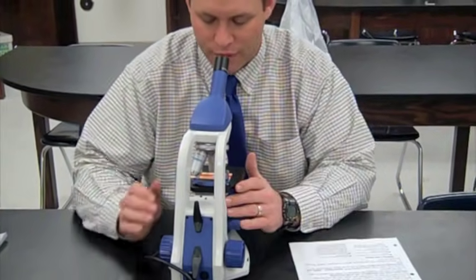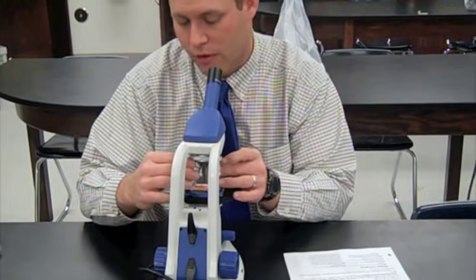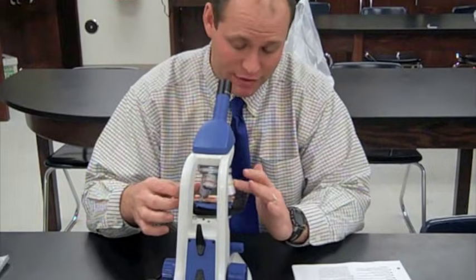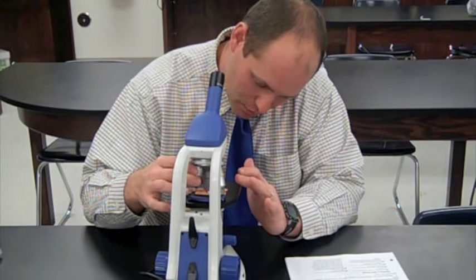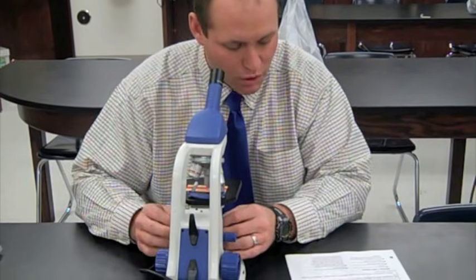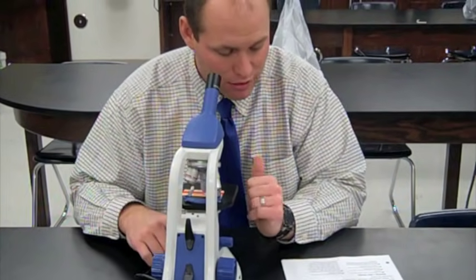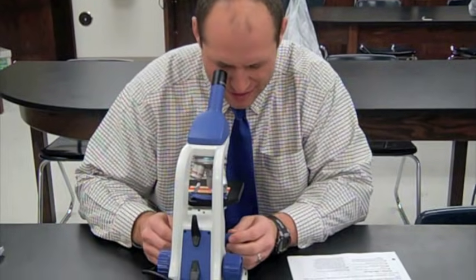Okay, now we're going from the 10x power to the 40x power, and it's probably one of the harder things to do because you have to switch it without touching the slide or moving the stage. Again, it's going to seem like the slide is going to hit, which it may, but the objective lenses are built in a way where it should not matter. Now, once you are in the highest power, the 40x, do not touch the coarse adjustment. You can only touch the fine.